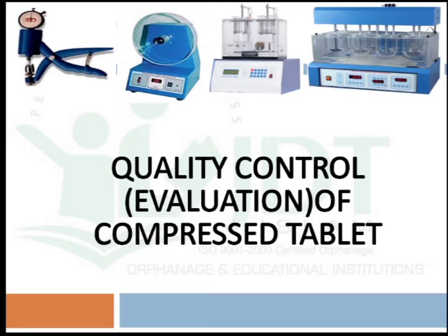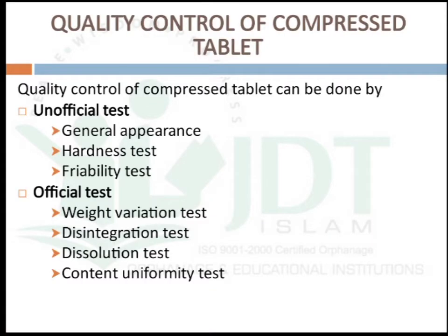In this video, we will discuss the quality control tests of compressed tablets. These are also known as the evaluation tests for compressed tablets. Quality control of compressed tablets can be done by either unofficial tests or official tests.